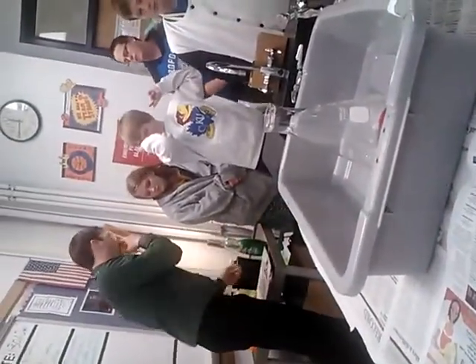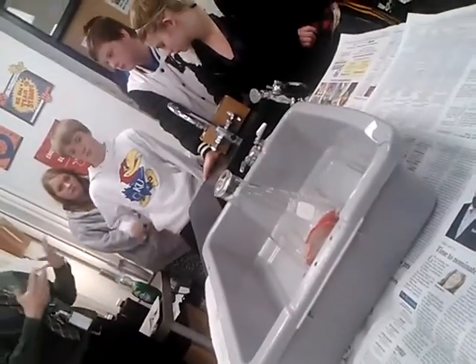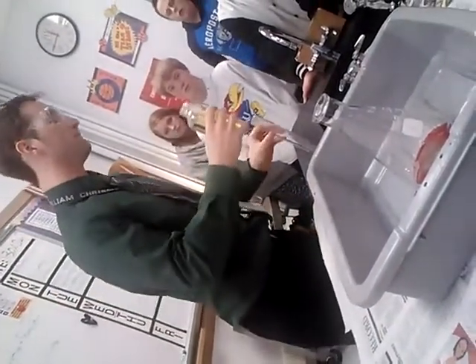Okay. Camera skills. Now, what we want to do is have what's called a decomposition reaction. We actually want to rip apart these atoms. There's a lot of energy holding the hydrogens and oxygens together. If we can rip them apart, all that energy will be released. So we're going to do an energy conversion. We're going to take apart the chemical energy of hydrogen peroxide, and we should get some heat from it. This is exothermic. The chemical that's going to do the ripping is potassium iodide. You could use sodium iodide or anything, but we're going to use potassium iodide. And we'll put about 10 milliliters of that in.